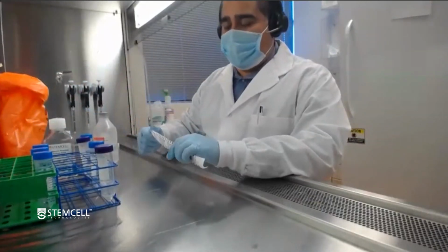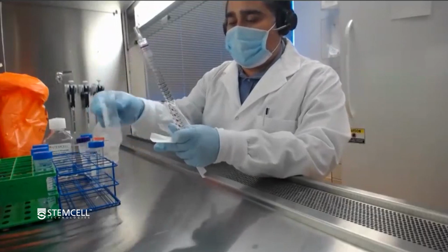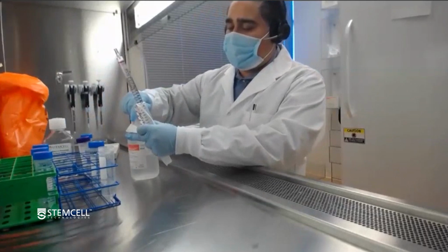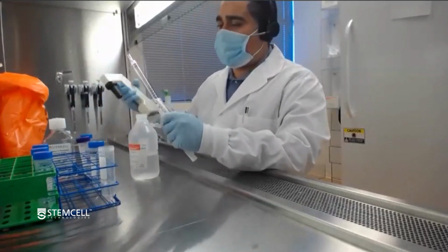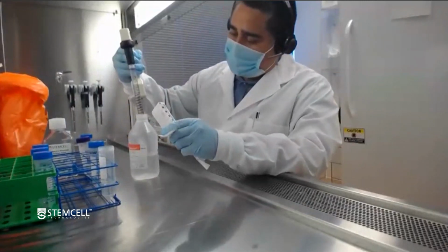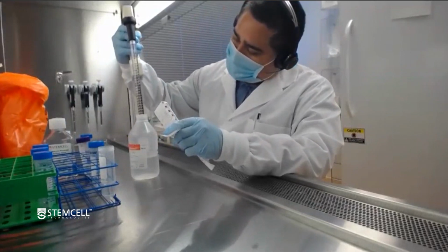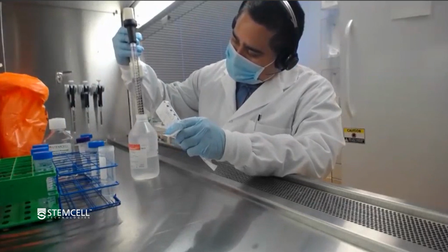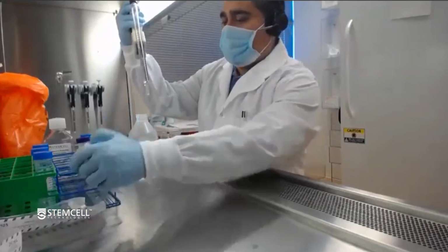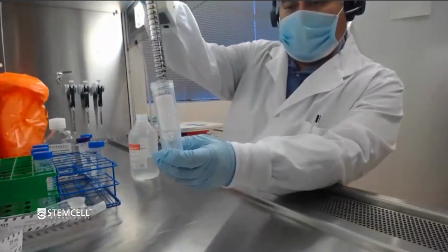So to prepare your SepMate tube, what you're going to want to first do is to have a pipette. Then you open up your SepMate tube, and then you want to take out 15 milliliters of your density gradient media, such as Ficoll or Lymphoprep. And you want to ensure to use the graduations on the side of the serological pipette, not on the side of the SepMate tube. And then you will just place this tip right at the bottom, and then start dispensing.